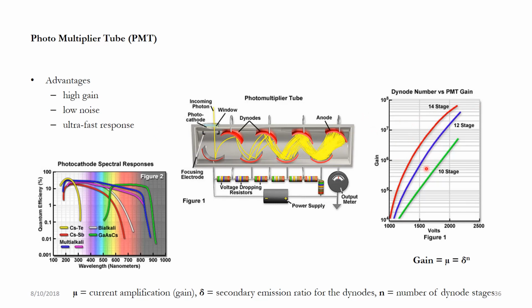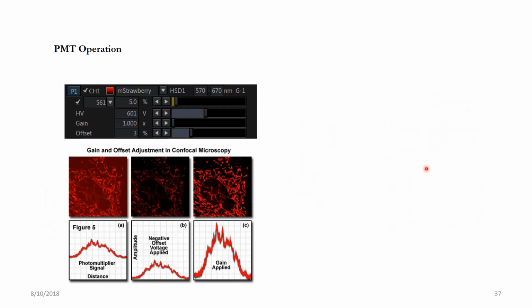Okay. Next is how do we use this on a daily basis on a microscope? How do we get a pretty image? That's the question. So this was the image that you were getting initially. For example, there are parameters which you can control. Using this you can control the laser power. Of course there are a few other parameters which I will show you how they affect the image.